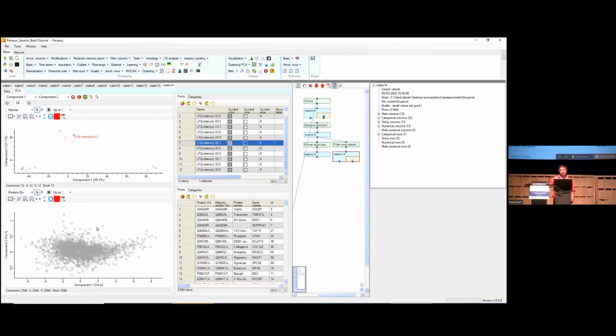If, instead of this cluster, you had a huge cluster here and a small cluster in this other area, then you would know that something real is going on if that is not expected, because protein expression should only be so different if you are expecting it, or if some biological process is going on in the background. Here we don't see two clusters, which makes sense because we're not expecting a biological process to importantly disturb the protein expression levels.